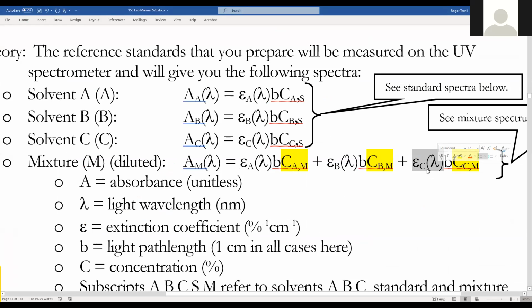No, blue is acetone, I think. You're right, ethyl acetate was orange. So you're asking what the extinction coefficient is at 268 nanometers. Isn't it going to multiply to 0 at that point? Yes, it's approximately 0, right? Yeah. So we can basically line it out here.